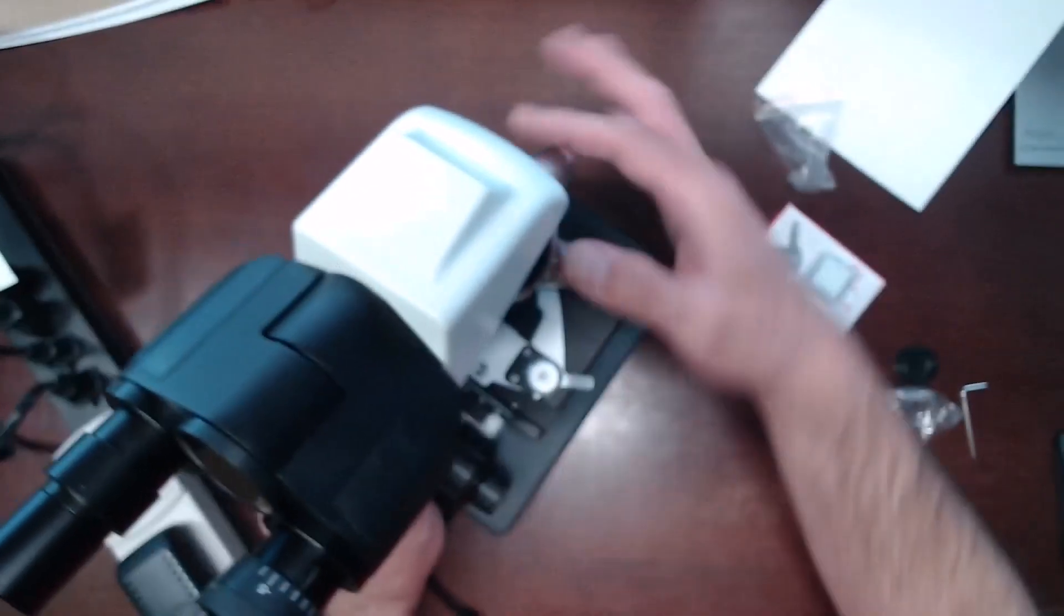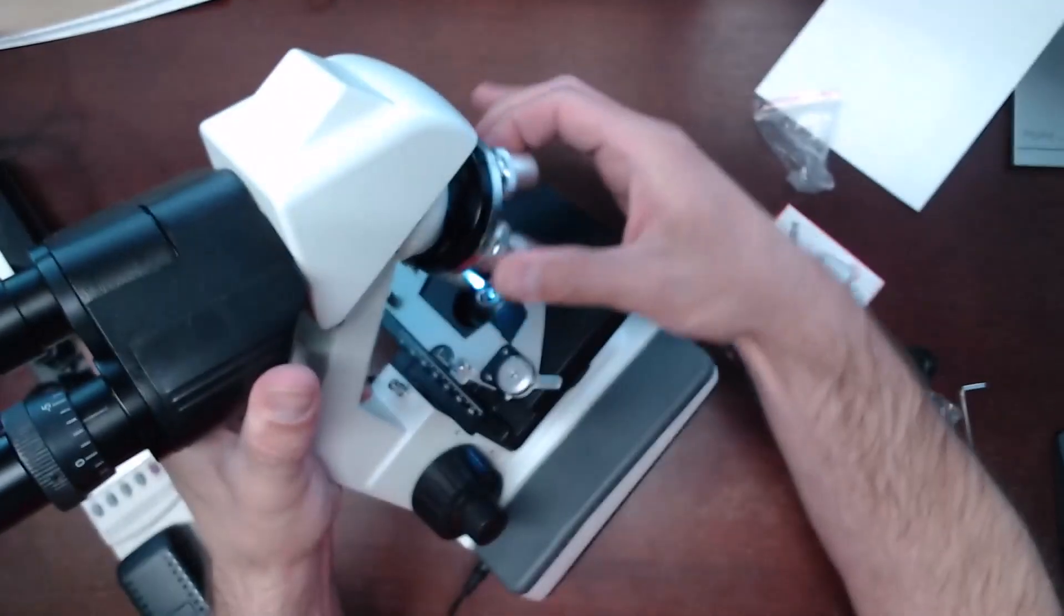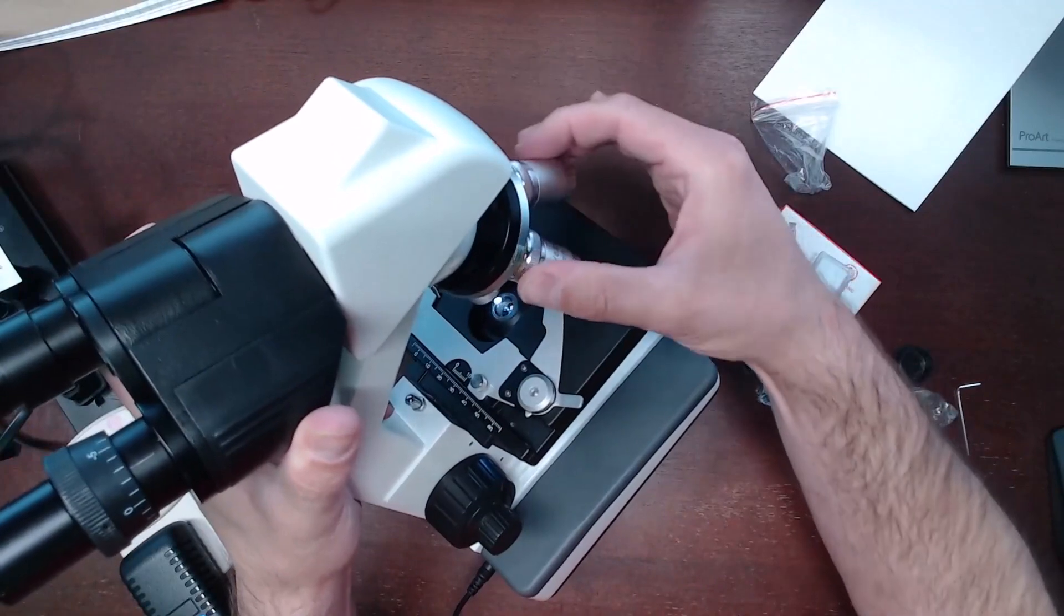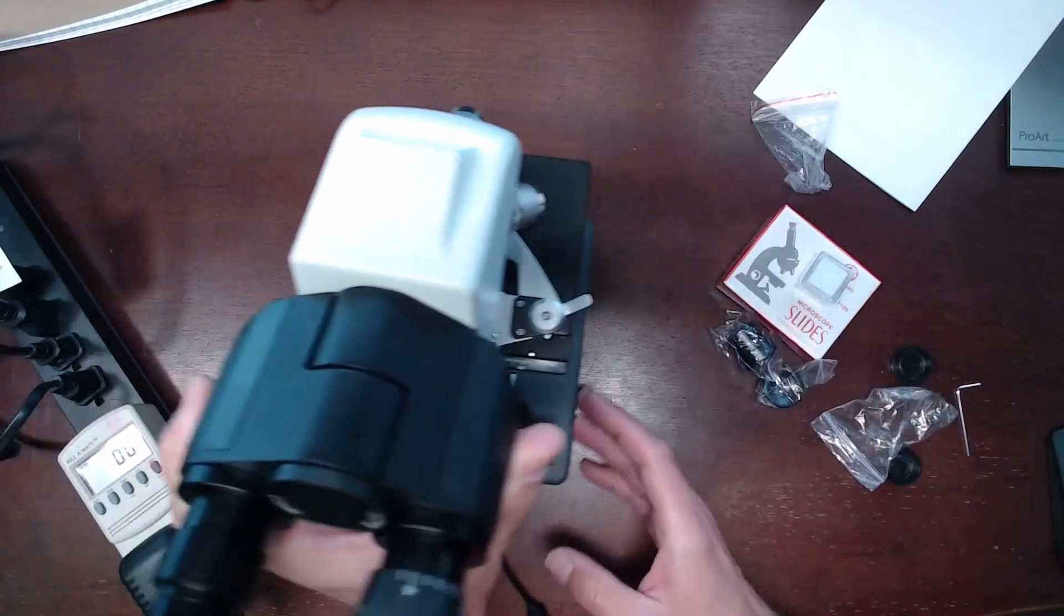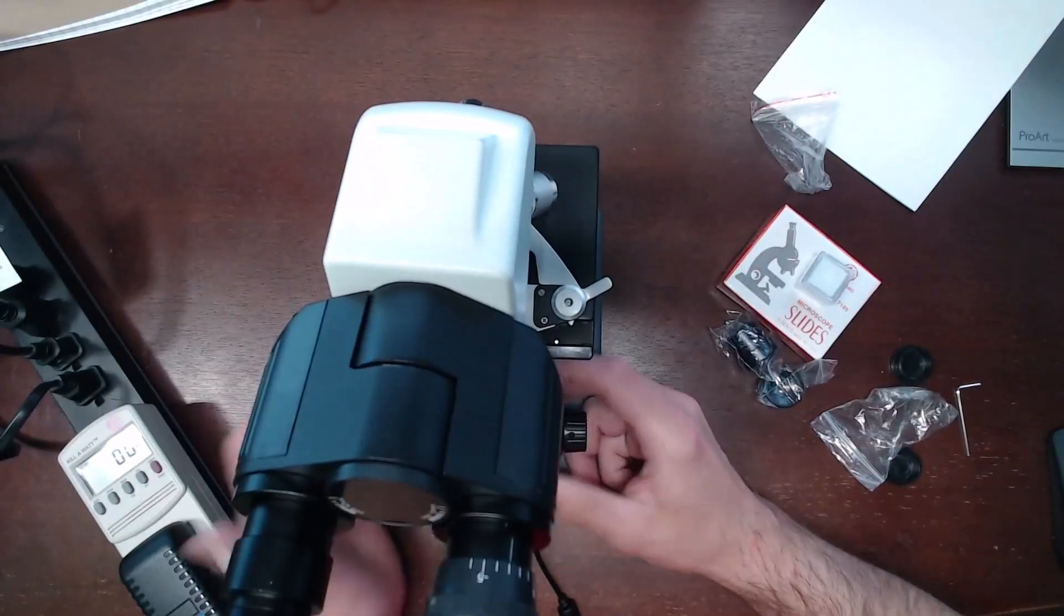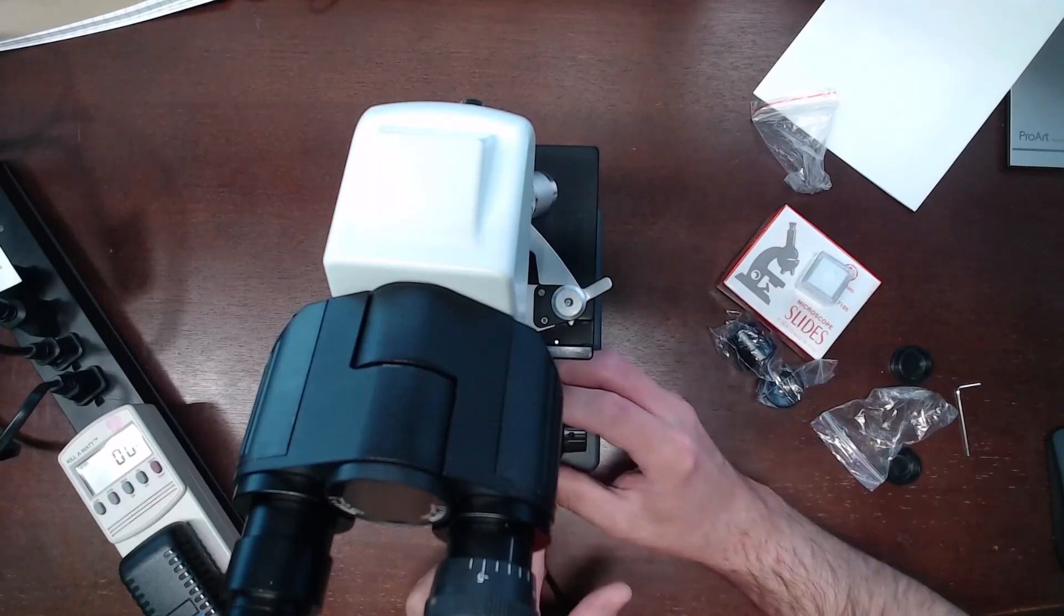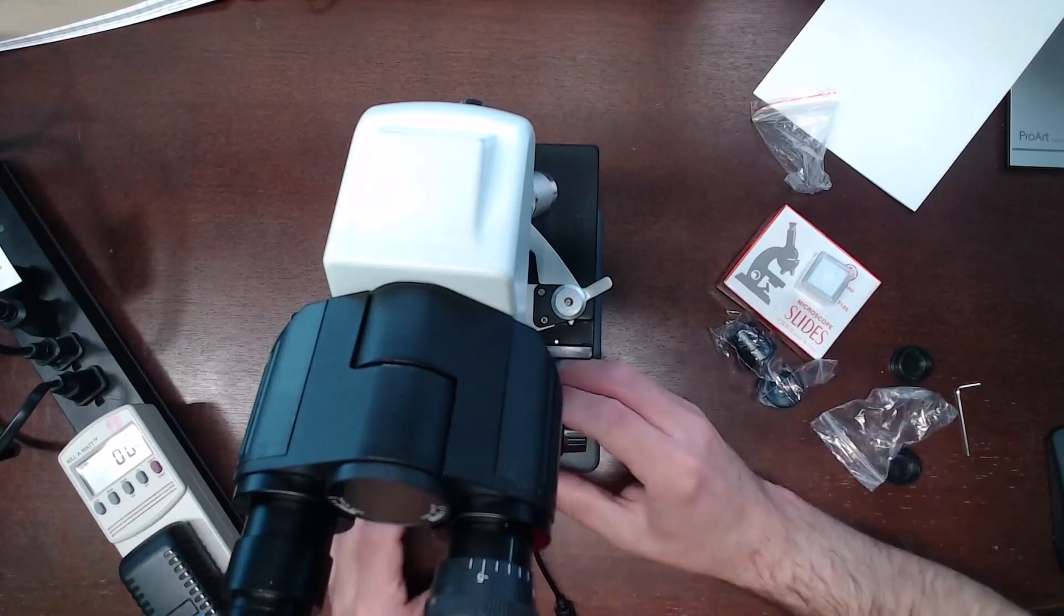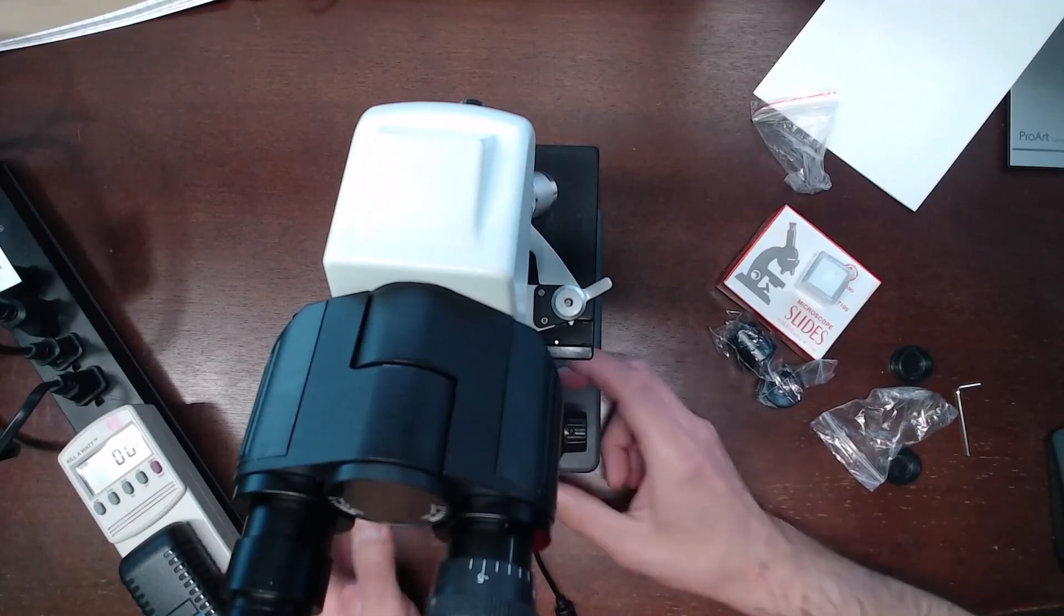There are four different powers on the microscope and they're easy to rotate. There's a small locking pin. It's kind of standard fare for microscopes I've ever used. You do have coarse adjustments for focus, which moves this whole stage towards the lenses. The large knob is the coarse or very quick movements, and then you have the smaller one for the fine movements for the focus.